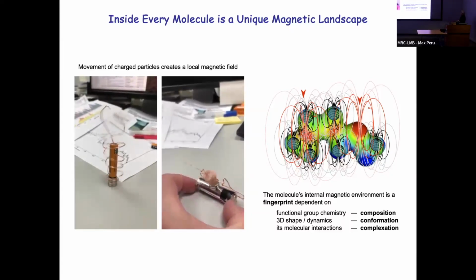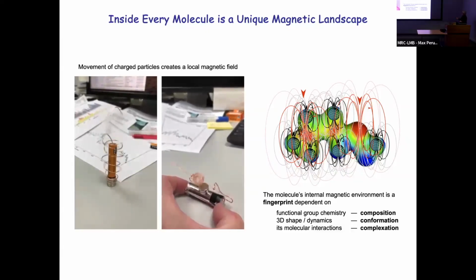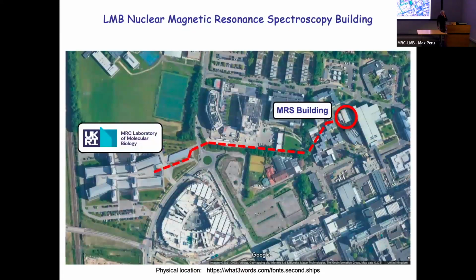So NMR is just exploiting these basic parts of electromagnetic induction to get the composition, the conformation, and complexation of molecules in solution. We have a well-equipped NMR facility at LMB. It's been around for 25 years now. And even before the LMB main building was opened, we had our own facility that is socially distanced away from the rest of LMB, about a 5-minute walk or so. And we house our NMR spectrometers in there.